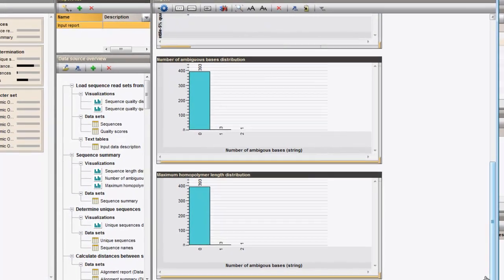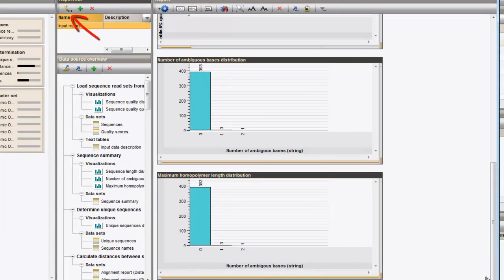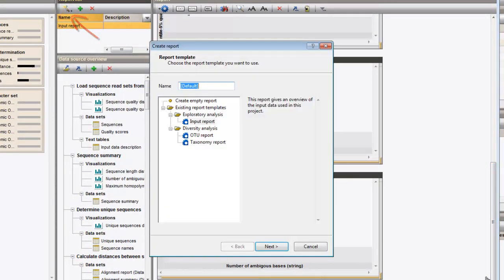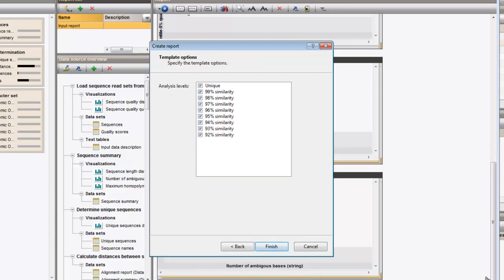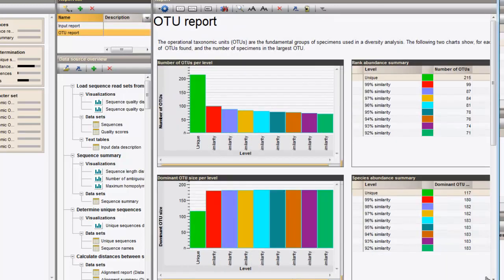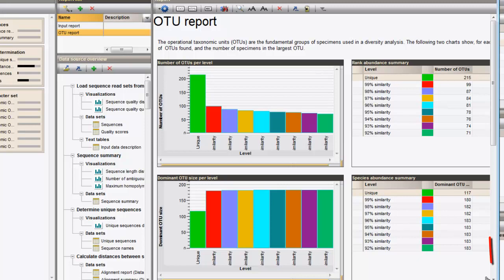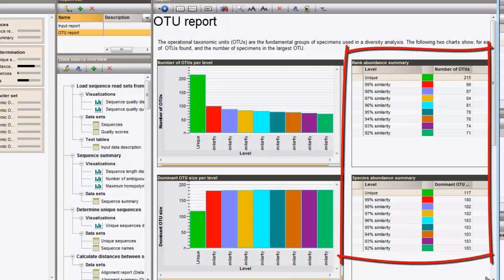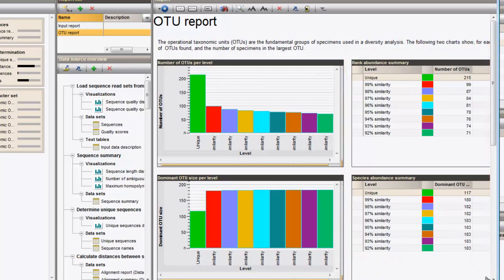The second report that can be called is the OTU report. We only want to look at the data of the unique reads and the reads at 97 and 92 percent similarity. In this report, an overview is given of the different OTUs that are considered for each of the similarity levels. The Rank Abundance overview, indicating the number of OTUs for each level, and the Species Abundance overview, indicating the dominant OTU size for each level, are displayed next to the individual Rank and Species Abundance curves for the specified similarity levels.